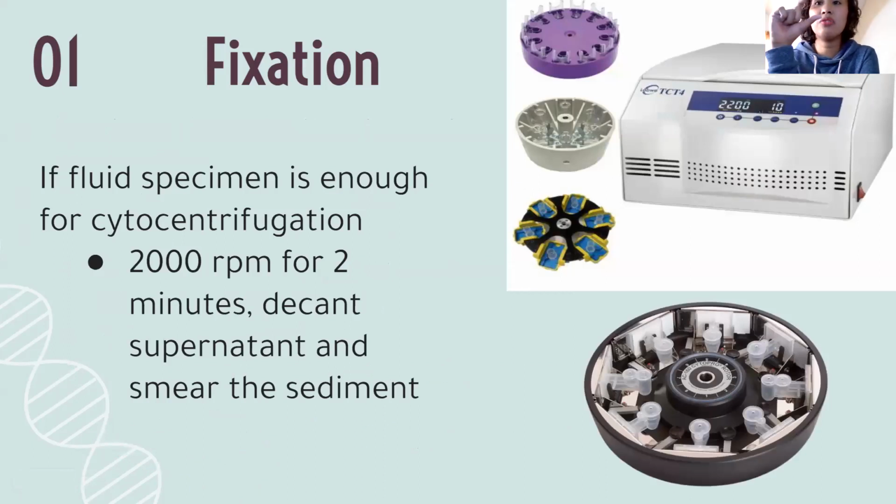So class, if there is enough volume, you could subject it to cytocentrifugation because the sediments are the most important part. So class, notice this cytocentrifuge. Ito yung nasa loob. Class, ang liliit ng lalagyan. Yan. So class, this machine is especially, it could be used specifically for our cytologic specimen. Kung konti yung volume. Pero sometimes, class, yung mga pleural effusion, it could be 1 liter, ganun, maraming ml rin minsan.